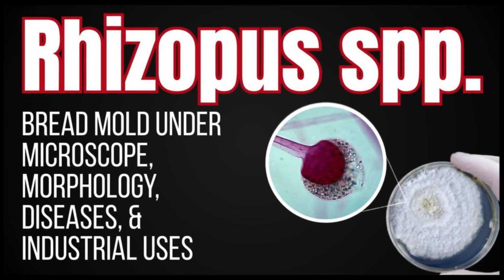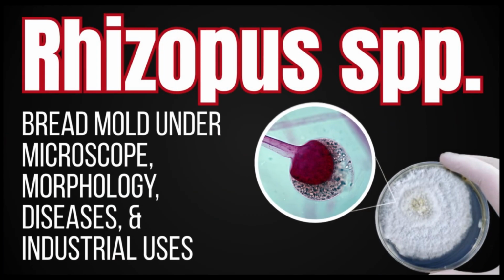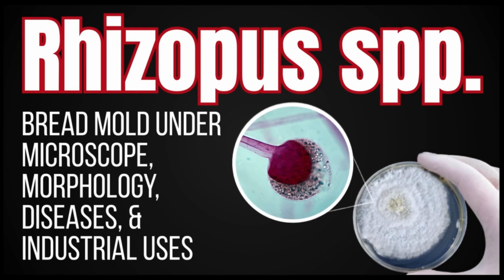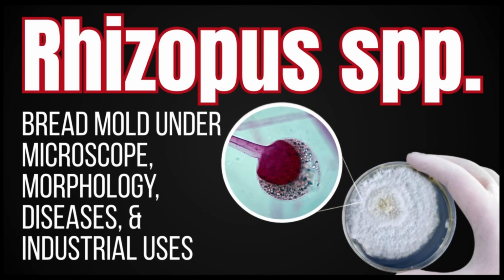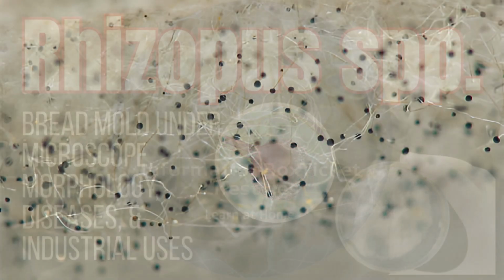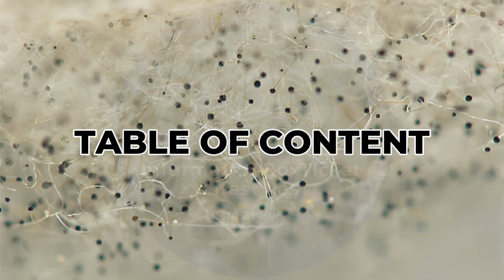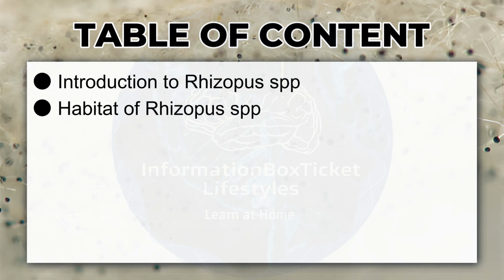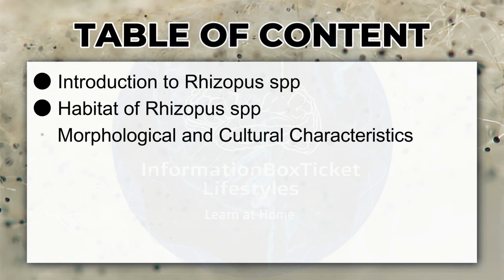Rhizopus species explained. Bread mold under microscope, morphology, diseases, and industrial uses. Table of contents: Introduction to Rhizopus species. Habitat of Rhizopus species.